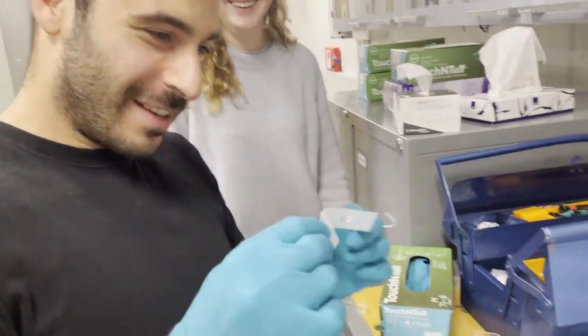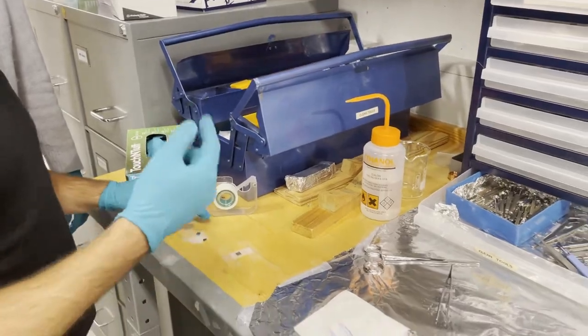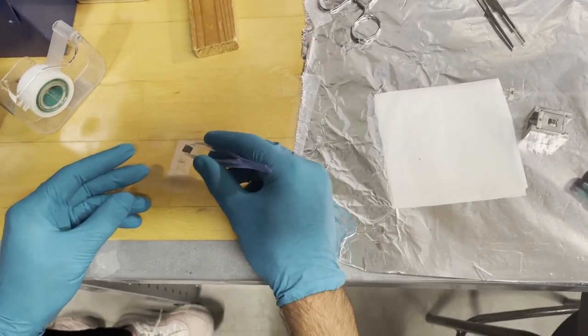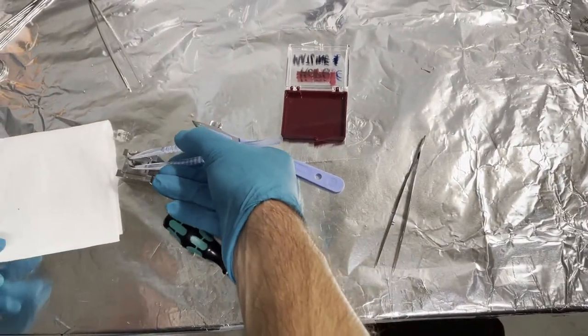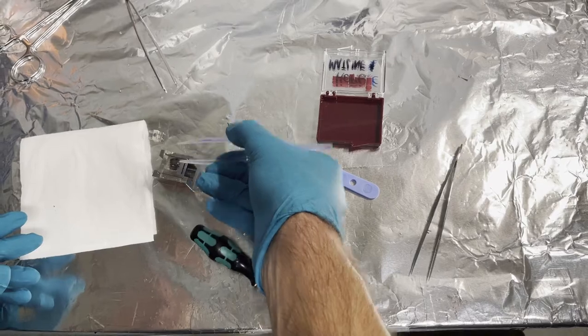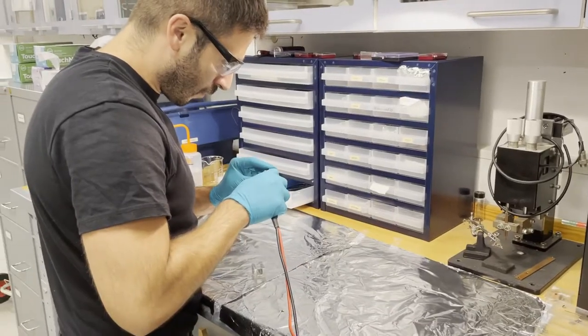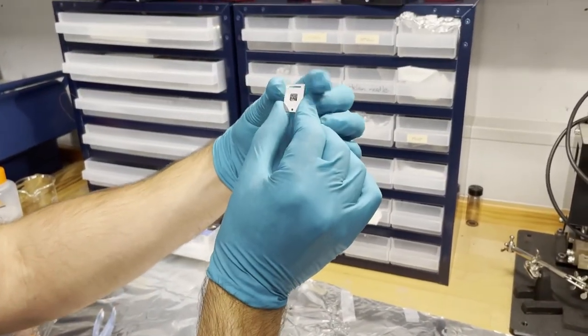Here you can see the removed layers. We now just need to place the graphite back into the sample holder. Secure it. And we have a sample ready to measure.